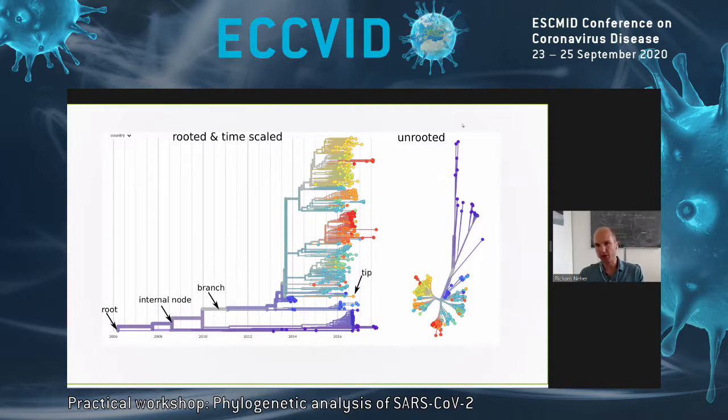Sometimes you also come across other representations of the tree where you don't have a specified origin or root, but you'd rather have a more agnostic approach, wanting to show differences between trees, and you'll find something like this. These are the same trees, just displayed in a different fashion. The fact that there are multiple different ways of looking at a tree should not confuse you too much.